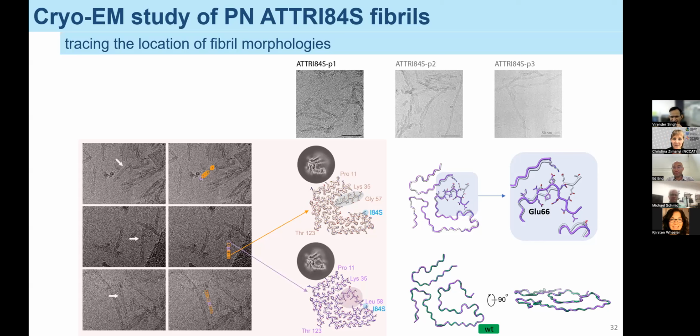Until these data sets, we were manually picking particles. I think our whole lab spent months picking particles from this. But now we are training Topaz, and we are mostly relying on auto picking. I think we are getting good structures out of auto picking, so almost saving months of manual labor.